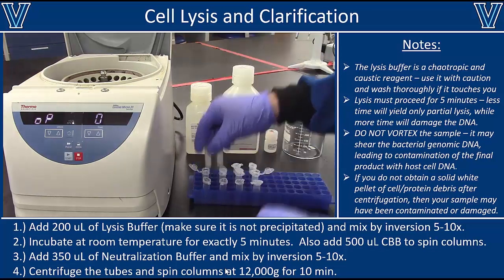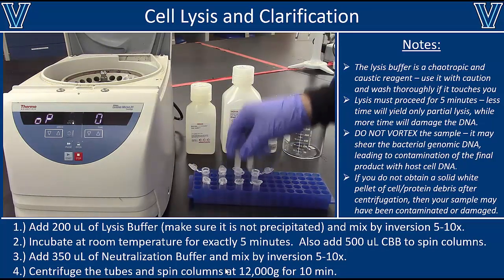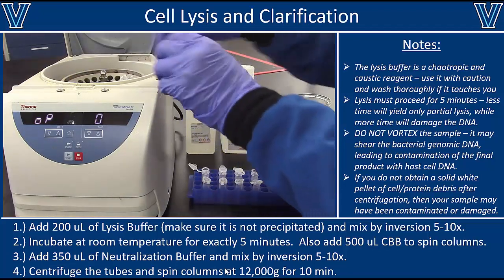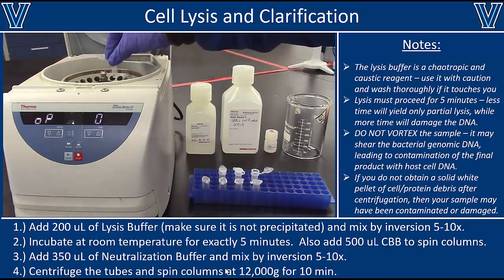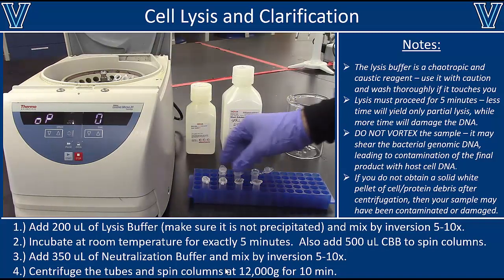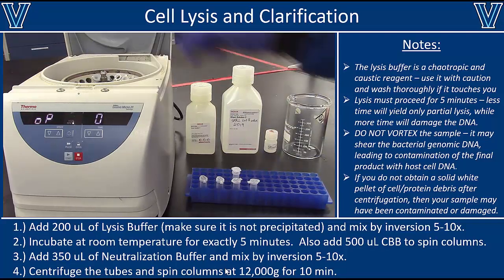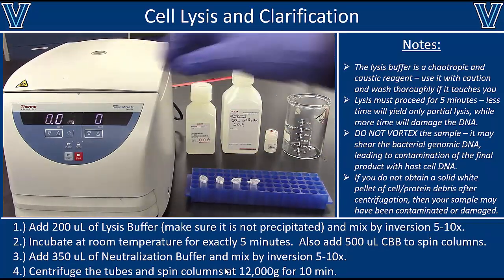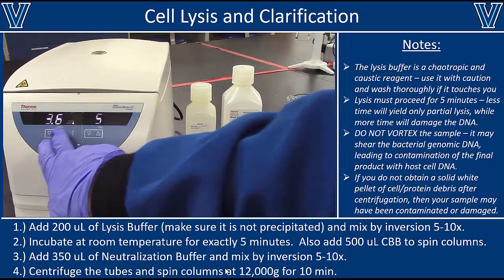Okay, so to clarify these samples, the next thing we're going to do is centrifuge them at 12,000 G for 10 minutes. But if you've already added the column prep solution, you can also put the spin columns in the centrifuge at the same time, just to save a little bit of time. All right, because we need to force the column prep solution through that column. So we're going to spin here. Again, 12,000 G for 10 minutes.